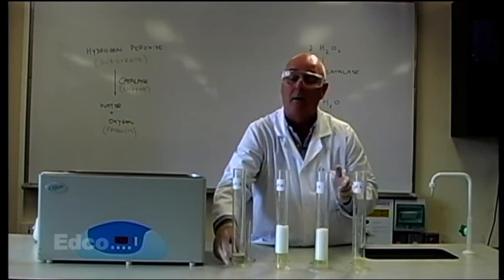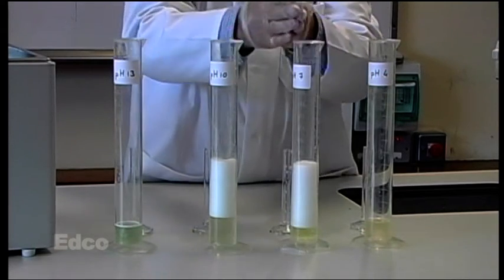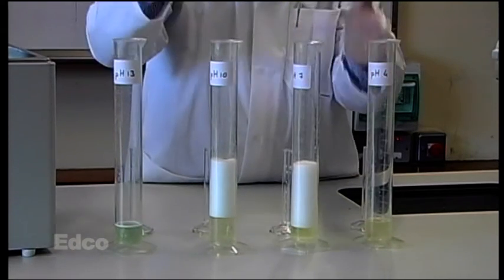So we've shown that the enzyme worked best at pH 10, it worked reasonably well at pH 7, but didn't work at pHs 4 and 13.